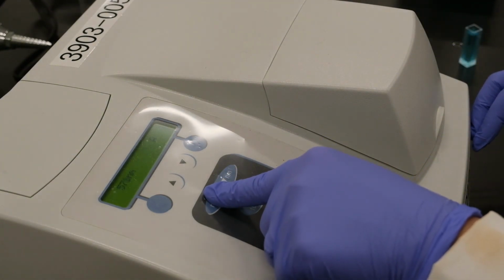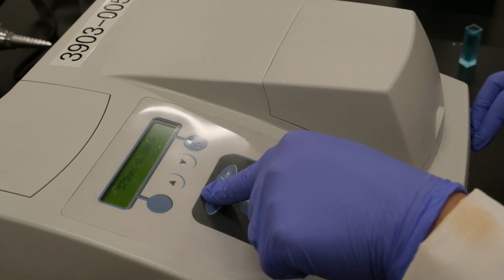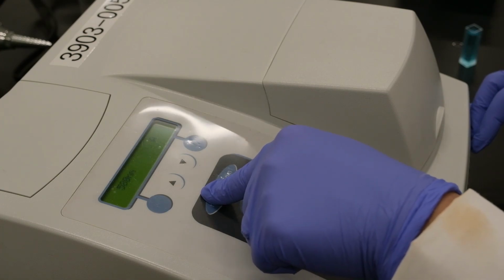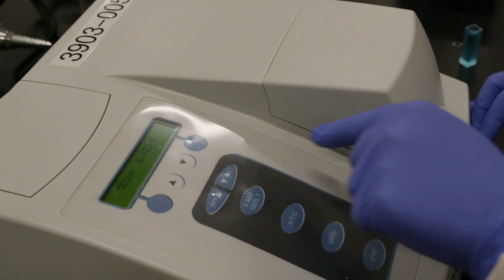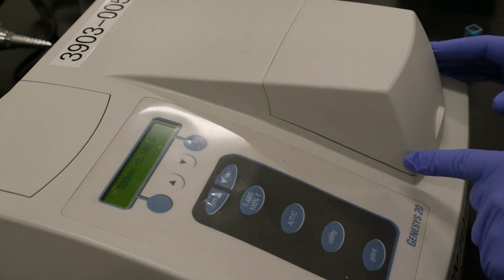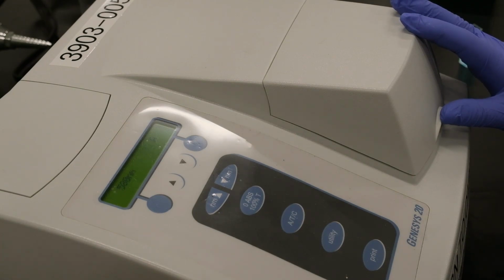And we keep going until we reach 660 nanometers, excuse me. And we continue until we reach 660 nanometers.